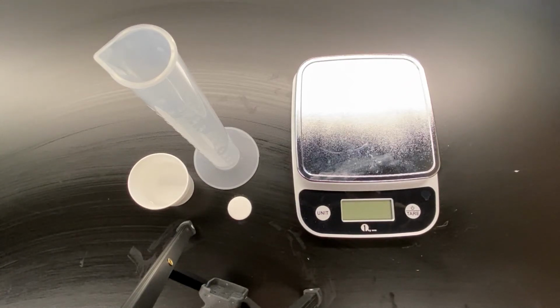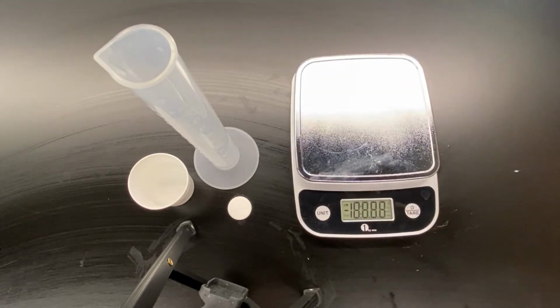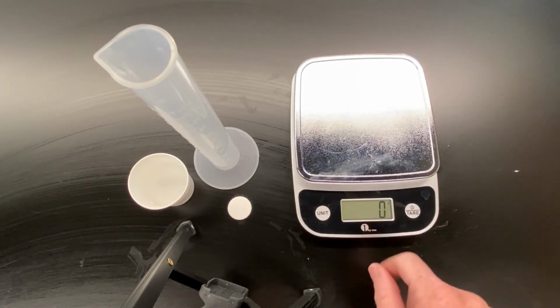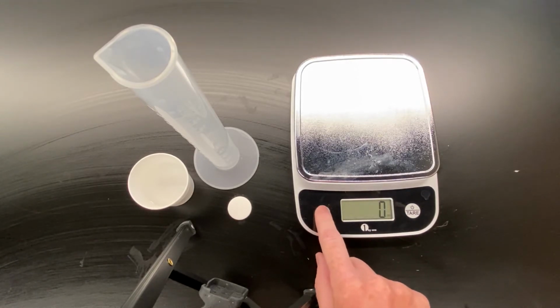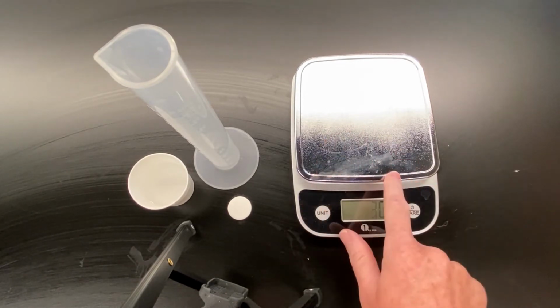All right, here's how we are going to set up experiment number one. First, you're going to turn on the balance. Right there, it says 0 g for grams, but if it doesn't, you need to press the unit button until it does. Now it says 0 g. Make sure there's nothing on your balance.